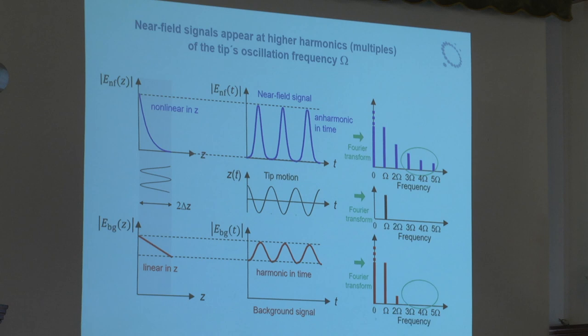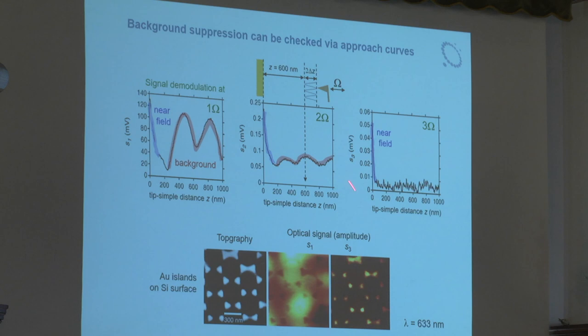So to demonstrate this is the case, this is some old measurements that I actually did back when I did my PhD thesis with Fritz, and this was done in the visible. And here one can see very nicely these background oscillations.